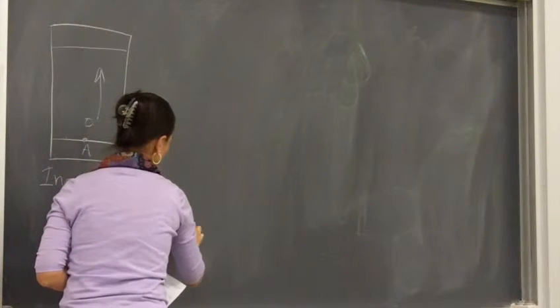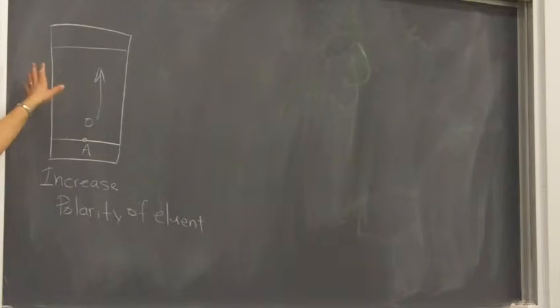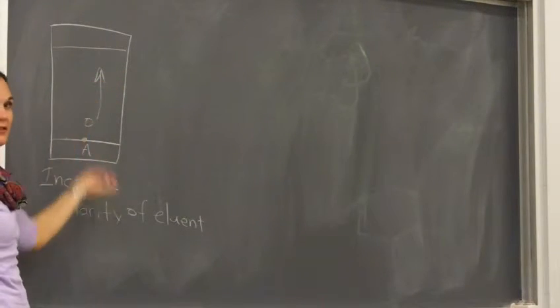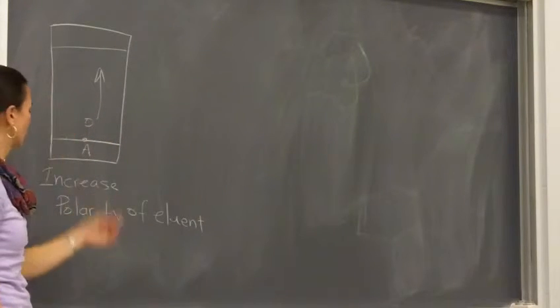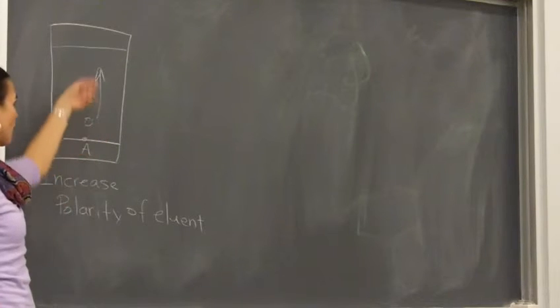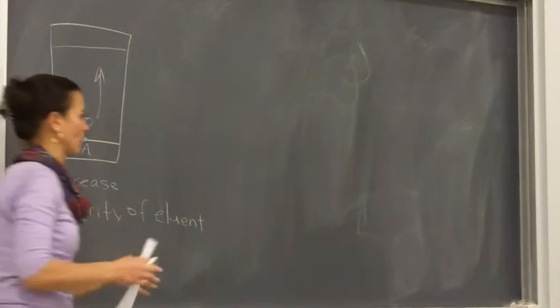And we're not changing the polarity of the silica. The silica is always going to be more polar than your eluent. So we're not going to flip this on its head, okay? It's always going to go this direction. So if we want to increase our RF value and how far it travels up the TLC plate, then we increase the polarity of the eluent.